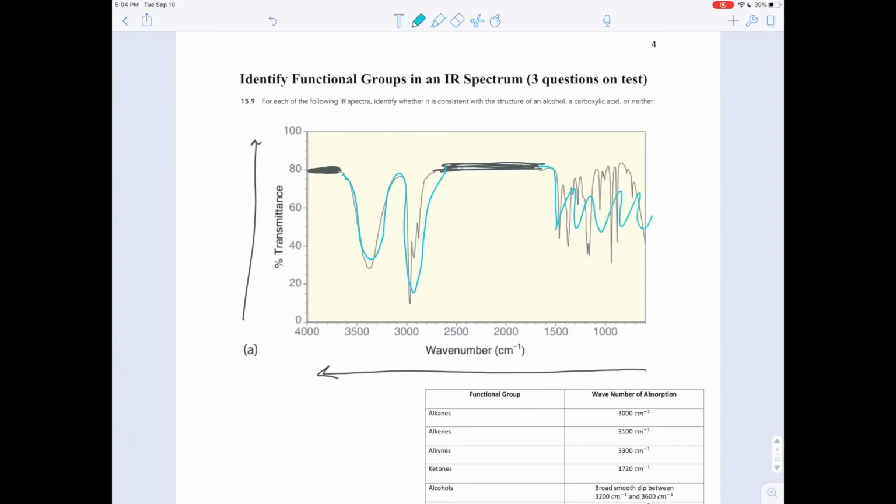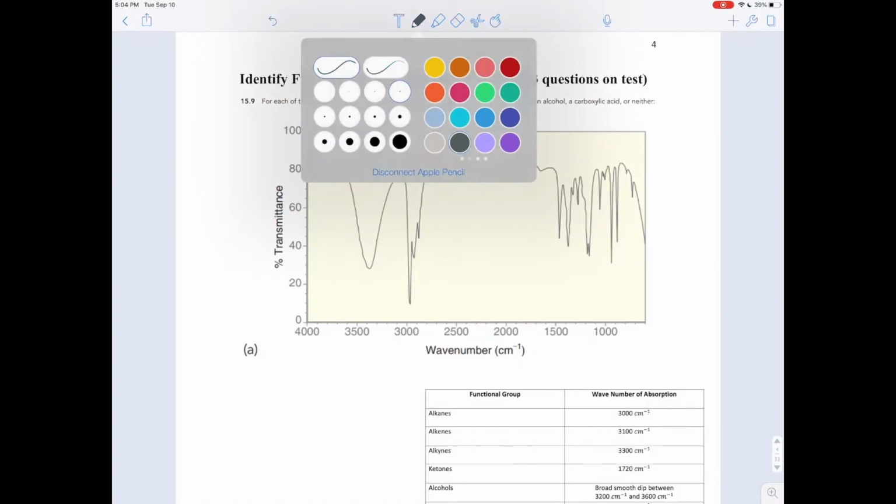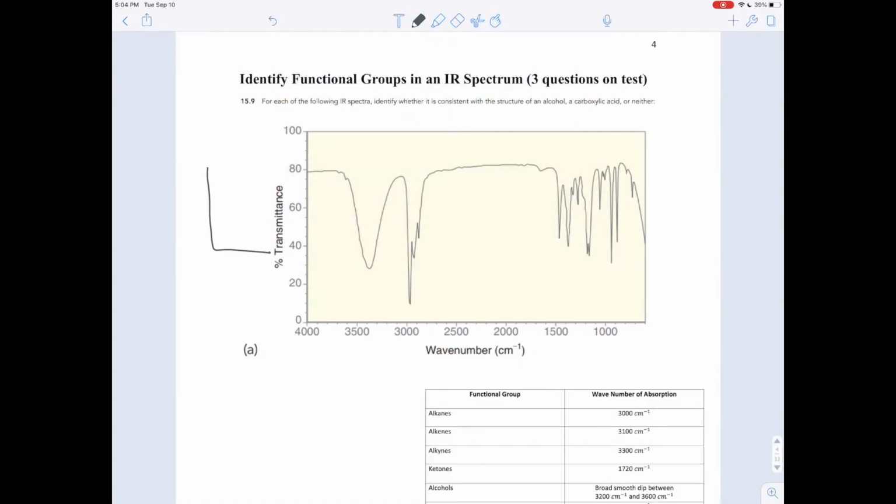And all these dips are shadows being cast by bonds in the molecule. Now bonds are quantized, so if you think of energy increasing as you go up, a bond will have a certain way of vibrating with a certain energy, and the next way it can vibrate will have a certain other energy, and there's no way that it can vibrate in between those two energy levels.